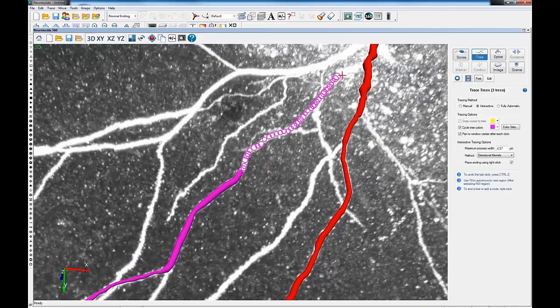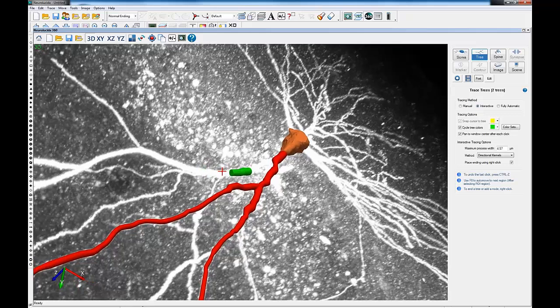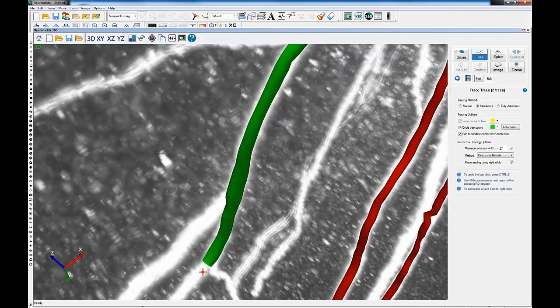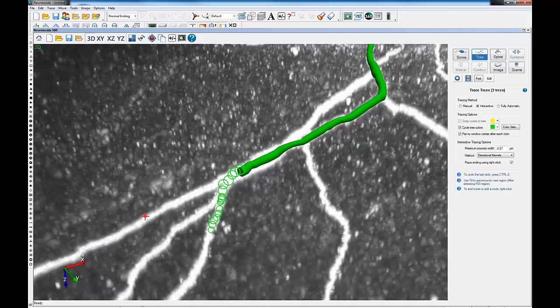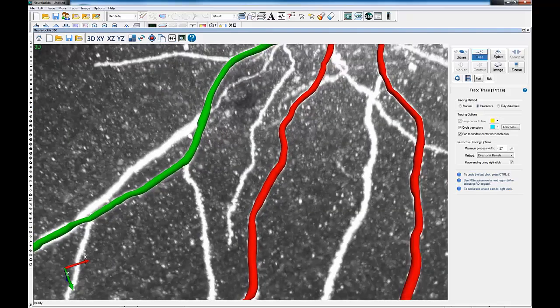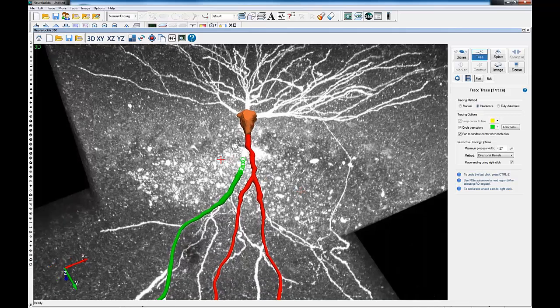For those of you who are used to using Neurolucida or tracing live from the microscope, you do have that sort of soma-centric view because that's where the party gets started. So just switching to this 3D environment really allows you to view where the automated algorithm is able to distinguish what's going on. And I really find that extraordinarily fascinating. I could do this all day long.